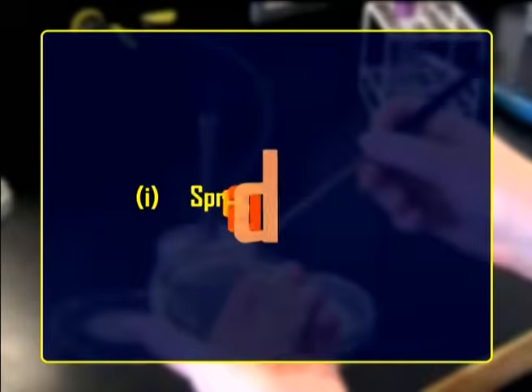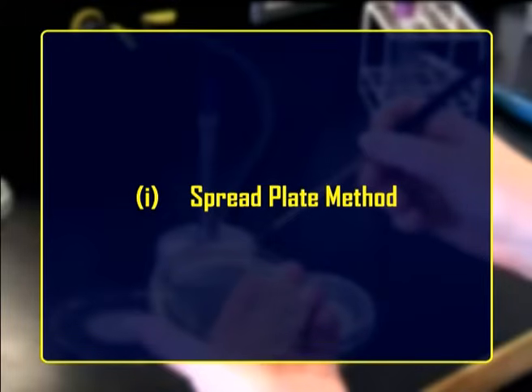Such colonies may be picked up easily and grown separately for further study. Several methods for obtaining pure culture are in use. Some common methods are in everyday use by a majority of microbiologists, while the others are methods used for special purposes. The first method employed for generation of pure culture is the spread plate method.